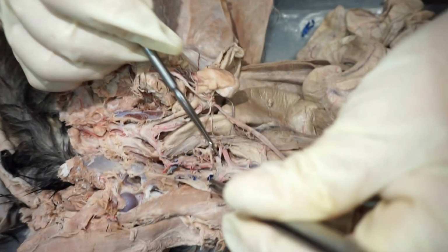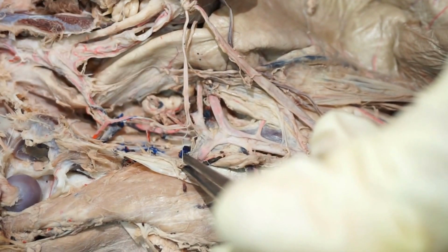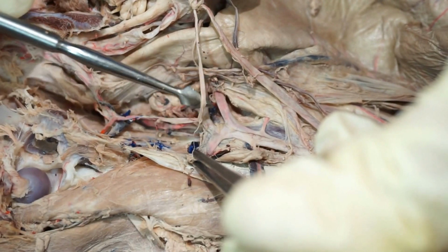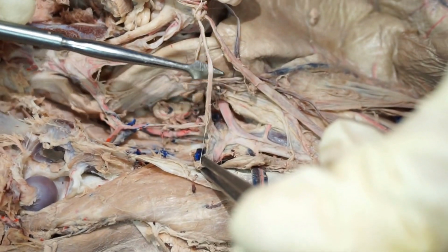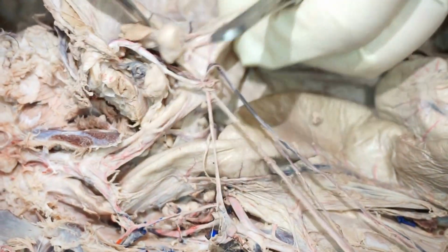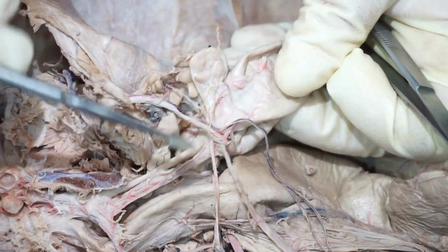So as you will recall, our abdominal aorta is going to come down and terminate as two external iliacs and two internal iliacs. From this iliac, one of the first branches that comes off is the umbilical artery, which would come over to this little bladder. Well, she's a big bladder, a fairly good-sized bladder.